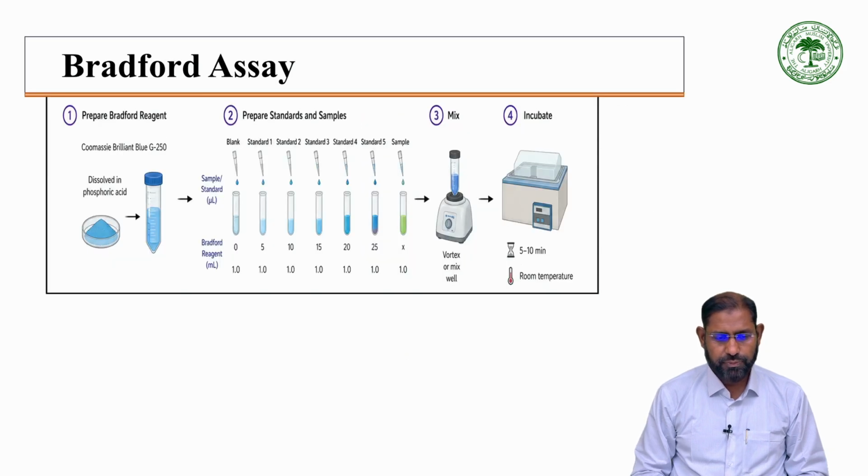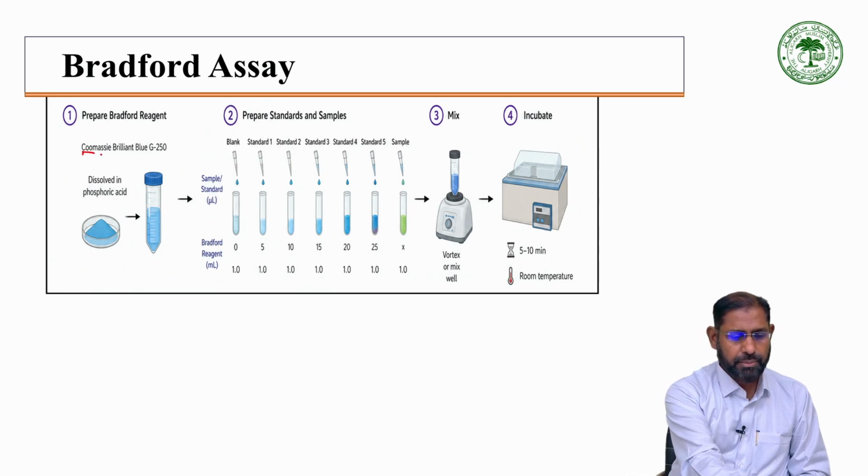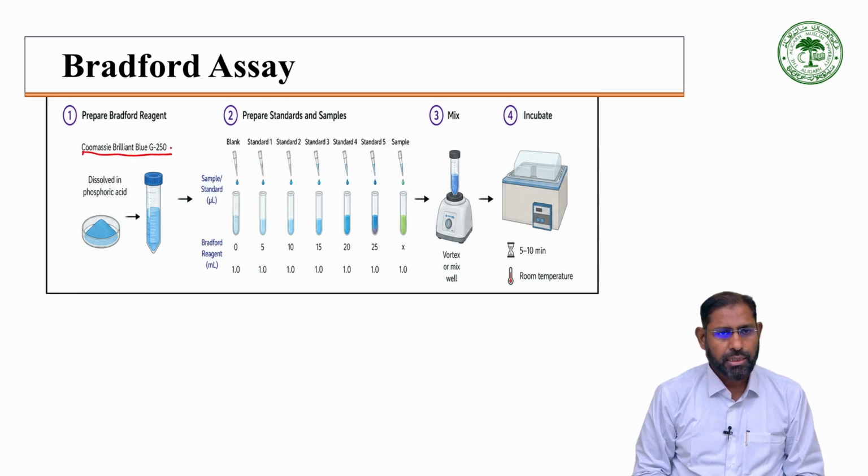Now the Bradford assay, prepare the Bradford reagent. The Bradford reagent is Coomassie Brilliant Blue G250, and we dissolve this in phosphoric acid and make a solution.